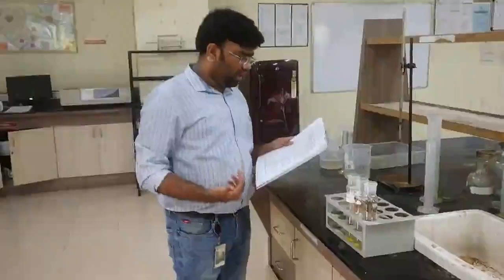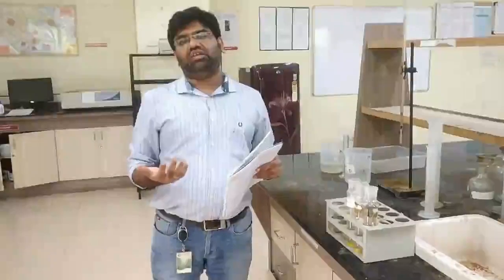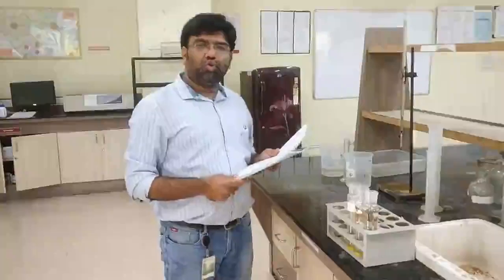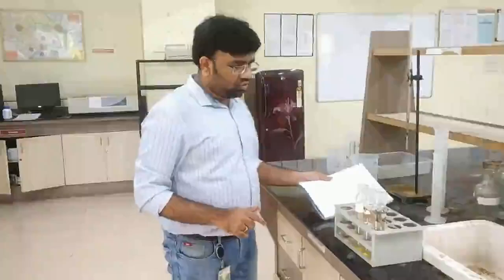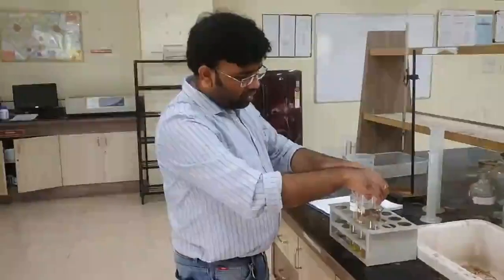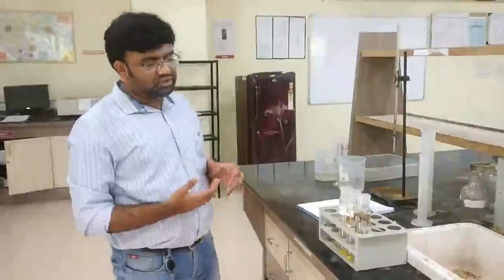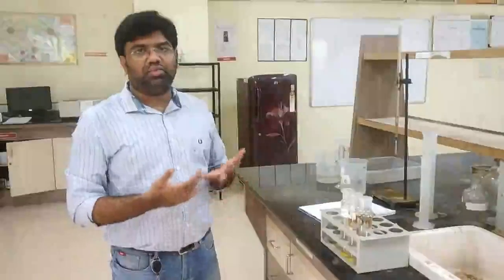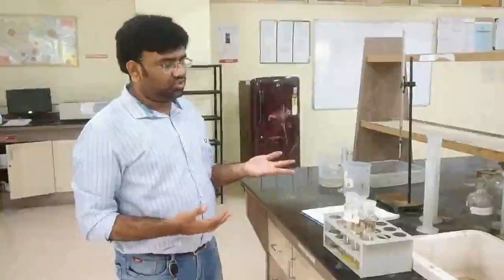If it would have been some different dilution, then double dilution, triple dilution, same as we have seen in the case of BOD would have been adopted. But in this particular case, we are only going to keep one single dilution. What we are going to do is keep 2 flasks for the same dilution. Why so? Because it requires 1.5 hours, and there is a lot of energy imparted for this reaction. So at a time we can keep like 15 flasks for the dilution purpose.